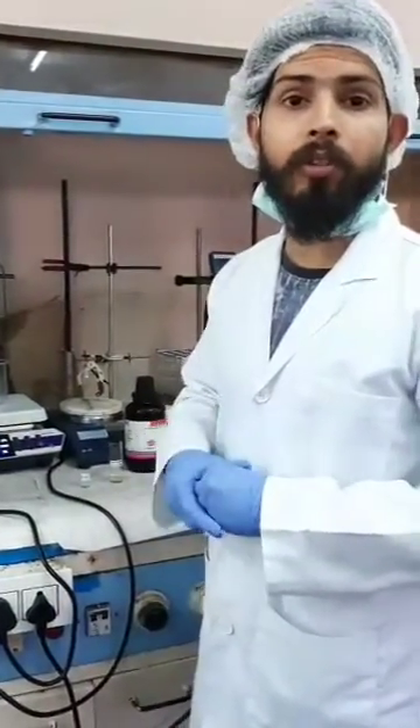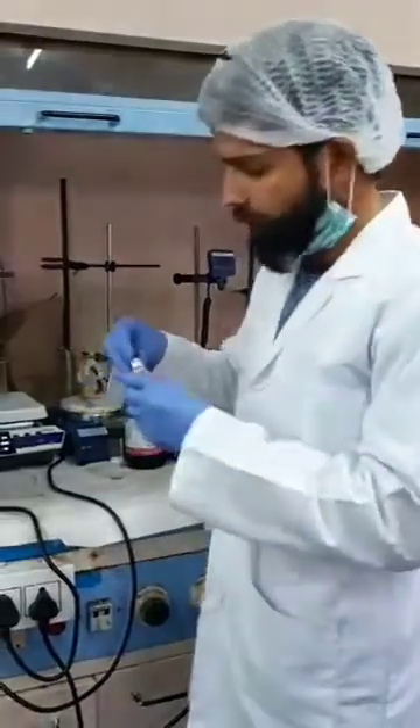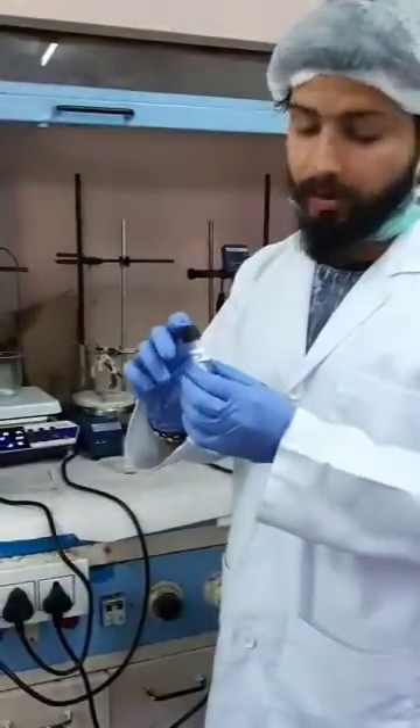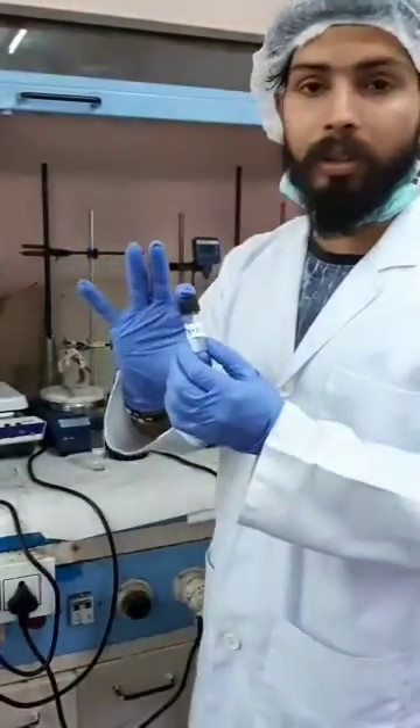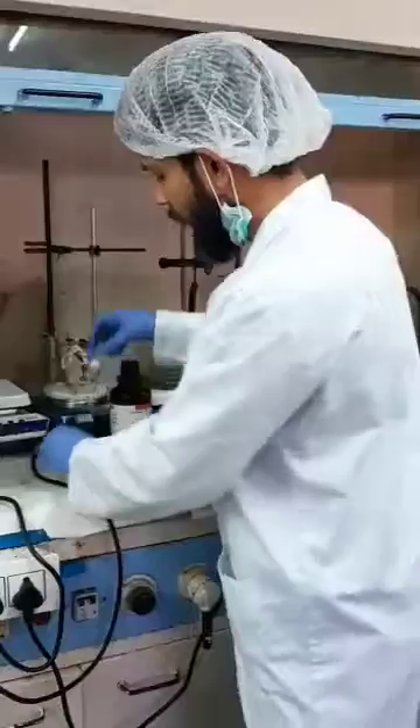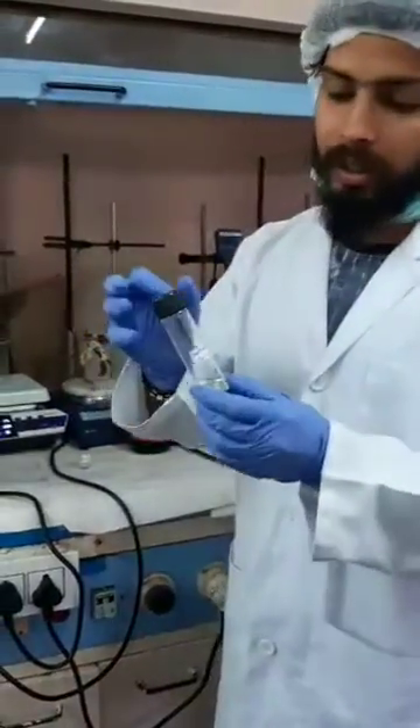I am Rohi Sharma, and my novelty formulation is a SMEDDS in which itraconazole is loaded. I am taking a vial in which the drug and oil are mixed properly by using a magnetic stirrer or by shaking method.